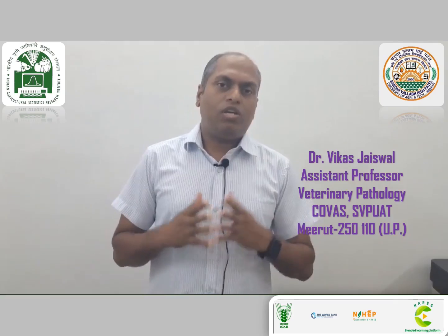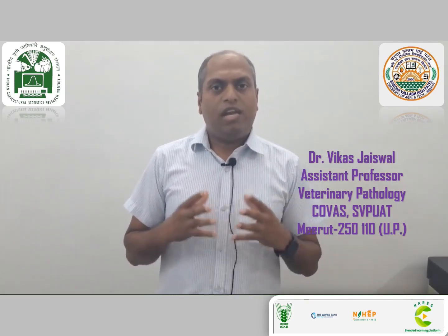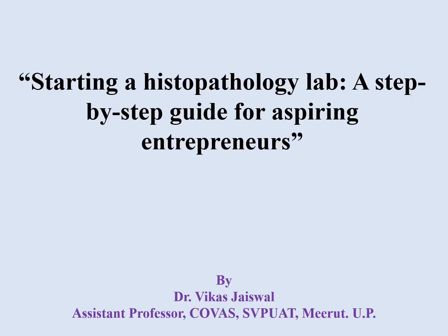So, friends, today we are going to start with how to set up a histopathology diagnostic lab. The topic of my presentation is starting a histopathology lab, a step-by-step guide for aspiring entrepreneurs.